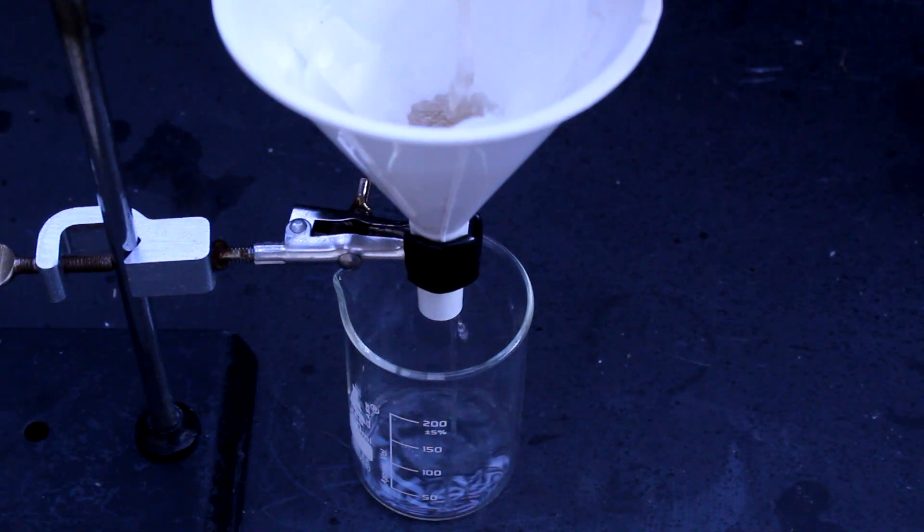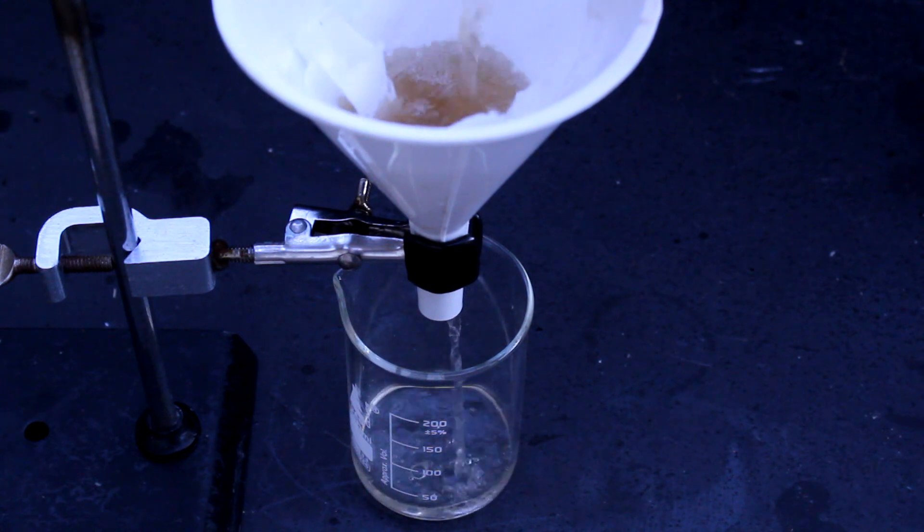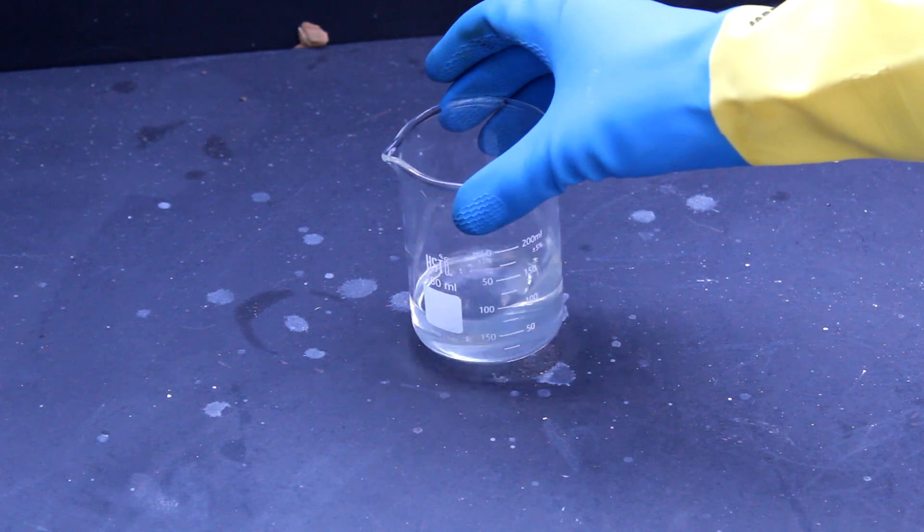Once the sodium silicate is dissolved, filter the solution a few times to remove any unreacted glass or contaminants. In the end, we are left with a clear solution of sodium silicate in water.